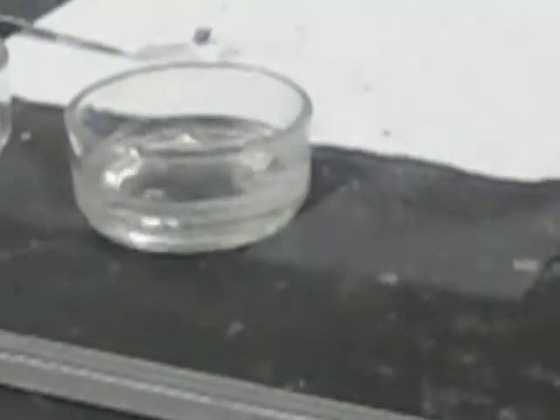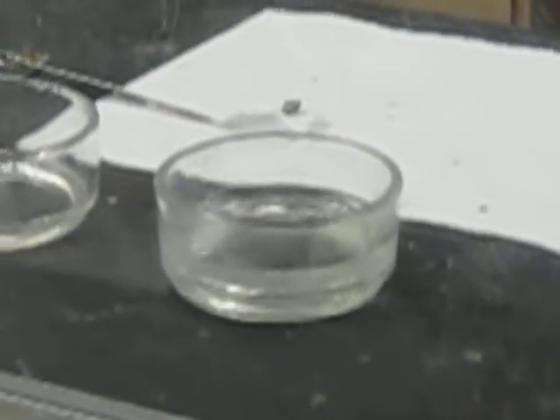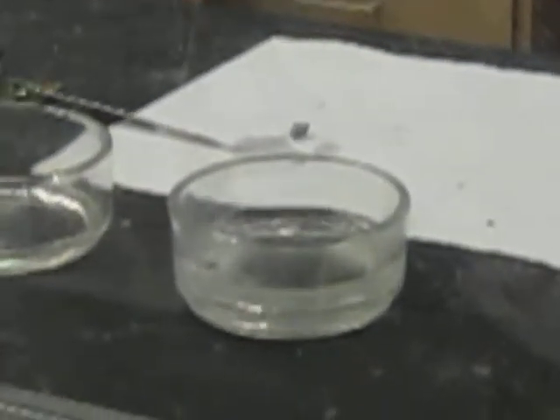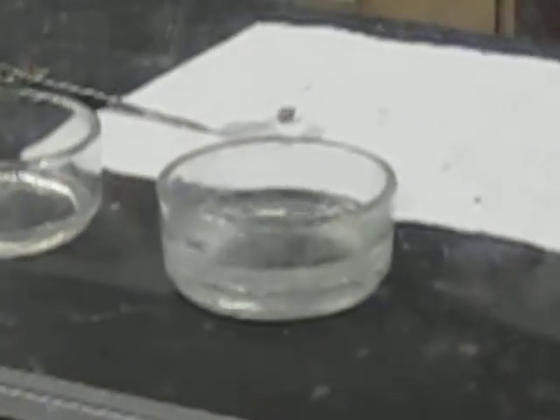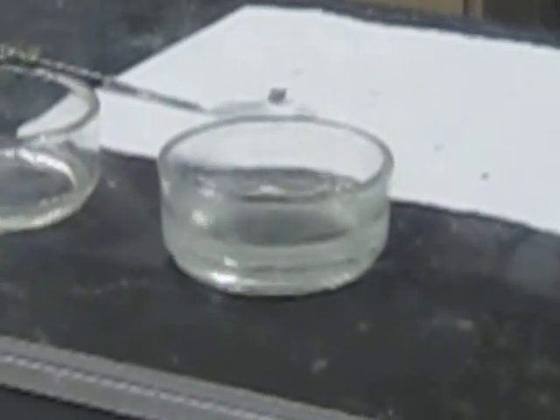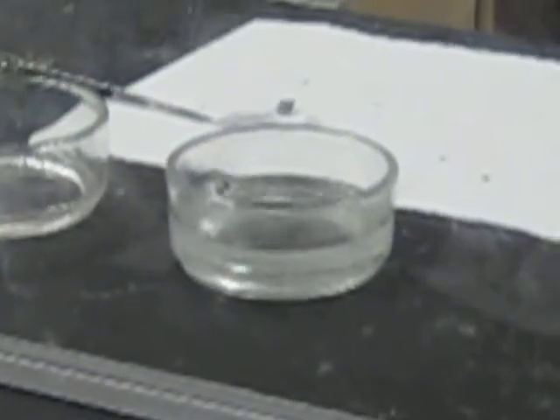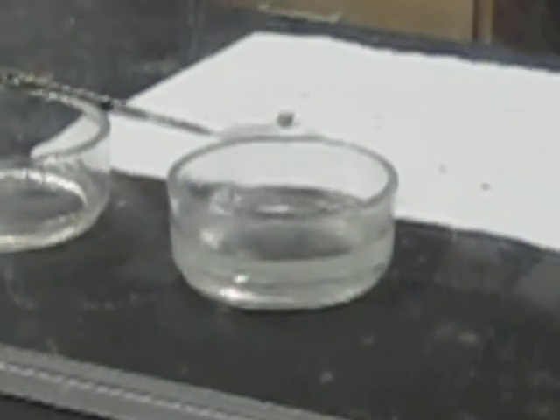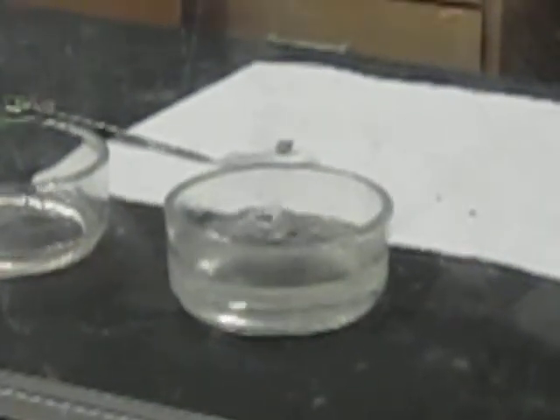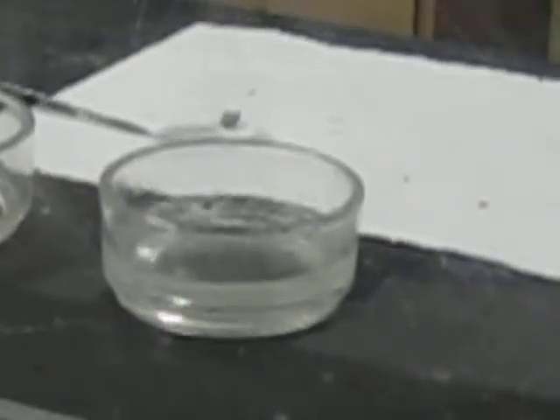So what observations are you making that's saying a chemical reaction's taking place? Bubbling and smoking. You see smoke coming off. What do you hear? Fizzing. All right, how do you know that this is an energetic thing that's happening? Because it's moving. It's moving around the surface of the water. So we know that there's energy that's being released.